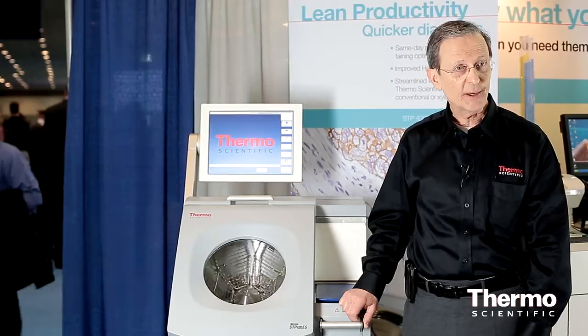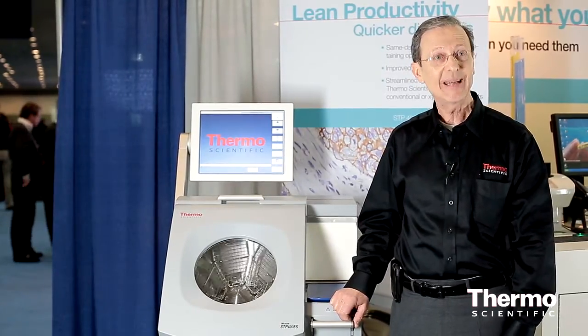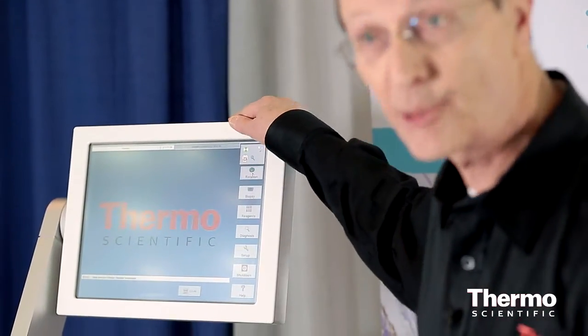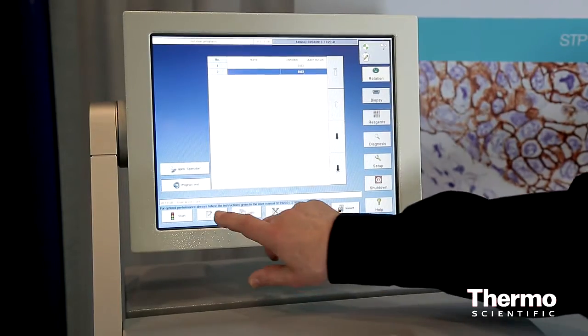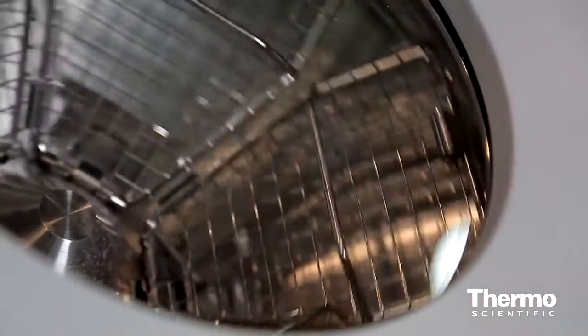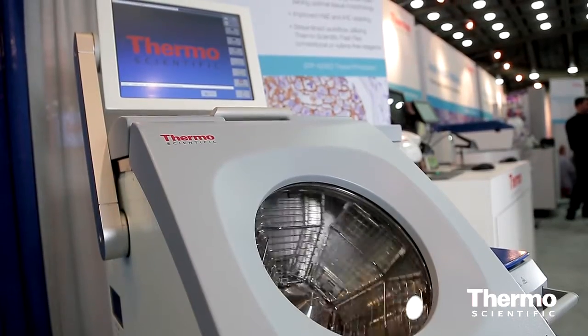This is the thermoscientific STP420ES rotational tissue processor. What's different about it is touch screen, very easy to use controls for the user, rotational agitation, that's a completely novel way of making sure that the tissue gets processed in the minimum time.